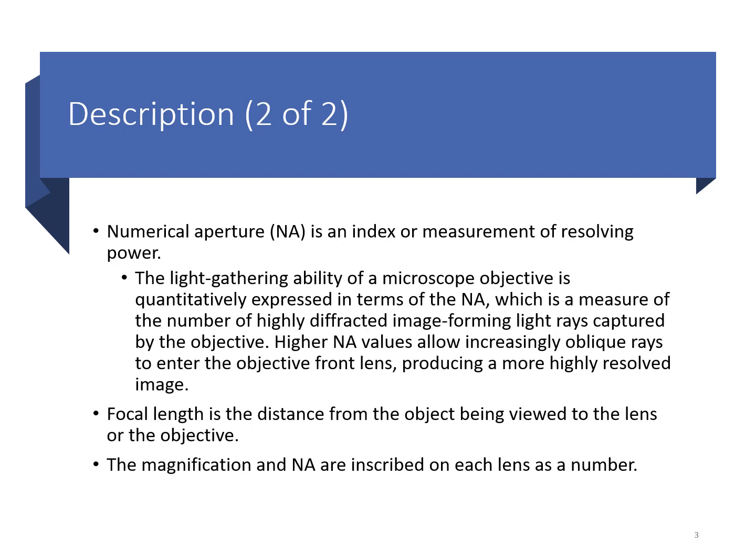And of course, part of that resolution is going to be dependent on a couple of things. Numerical aperture is one of those things. This has to do with the amount of light that you allow through and how it hits the image or the cell on that slide, and then how that light is redirected, which will factor into how crisp and clear your actual viewing field is in those cellular images on the microscope slide.